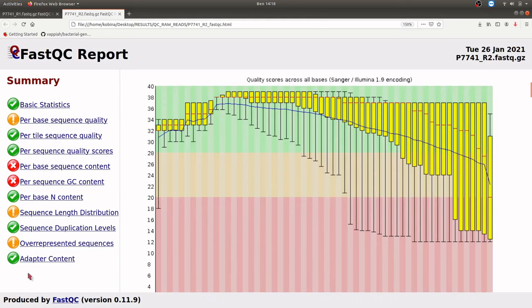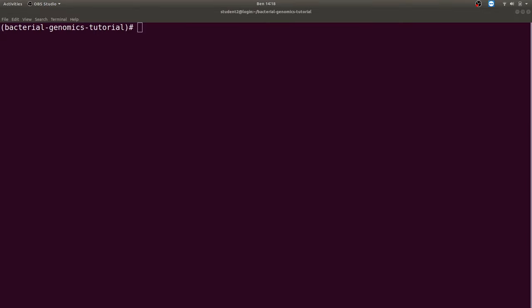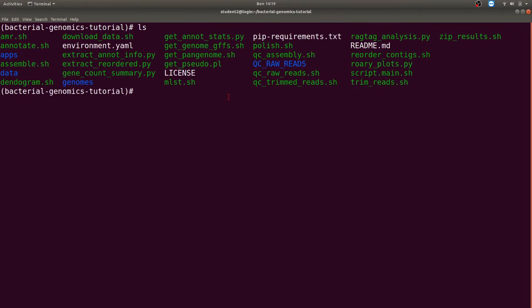Now we will do trimming, which is the next step, and then compare the trimmed reads to see whether trimming has improved the quality. We do trimming for a number of reasons: to remove bad quality reads, to remove sequence adapters, and other activities. Basically, trimming is meant to improve your reads and remove unwanted reads that might affect downstream analysis. I have a script to do the trimming for us.